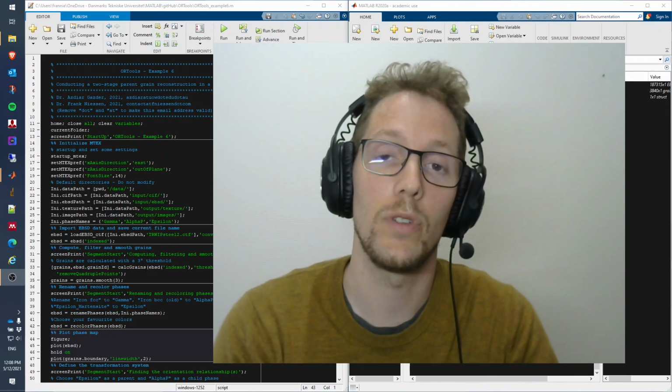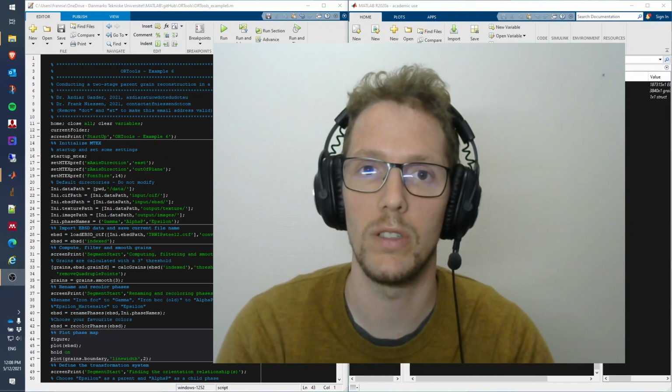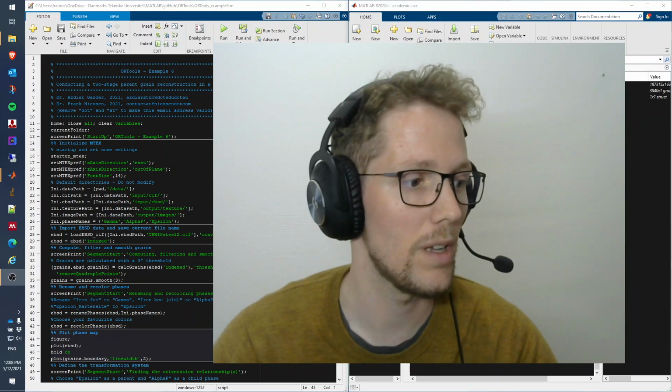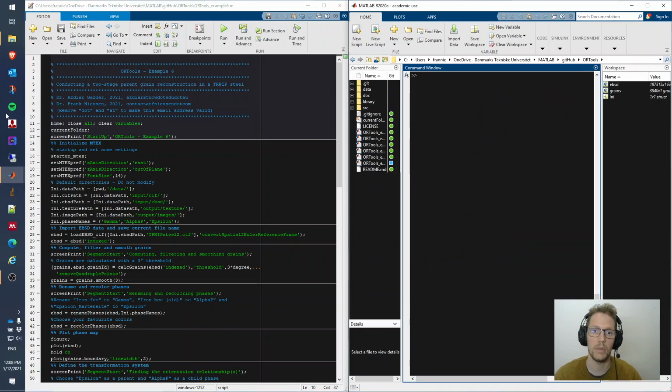Hi, today I have a new example to present to you. It's ORTools example number 6, and we're going to conduct a two-stage parent grain reconstruction in a twinning and transformation-induced plasticity steel. So let's have a look at the code. As always, you can find that on the GitHub repository under the examples, and it's number 6. And I'm going to run you through it step by step.